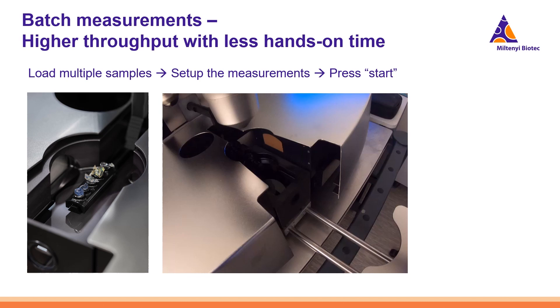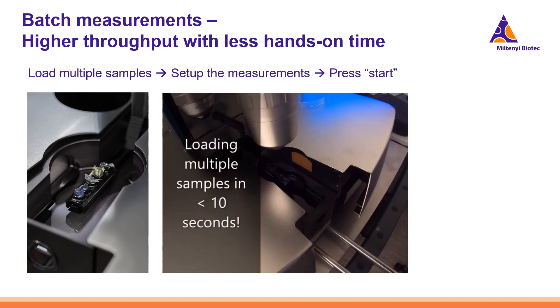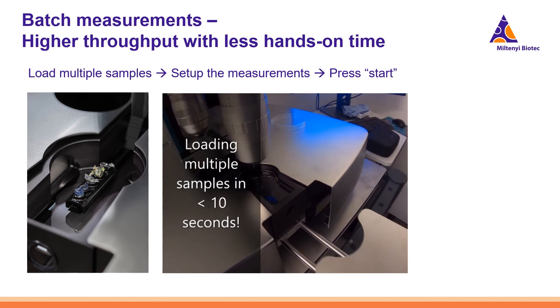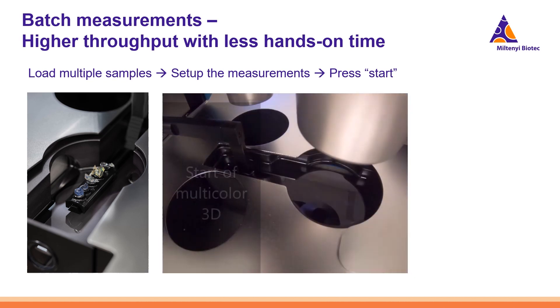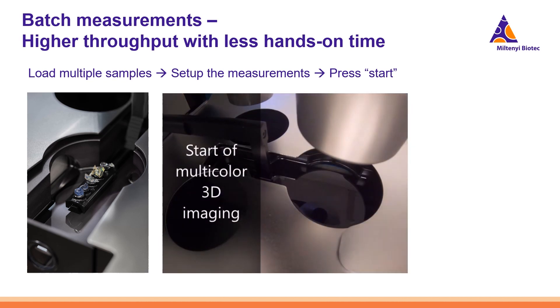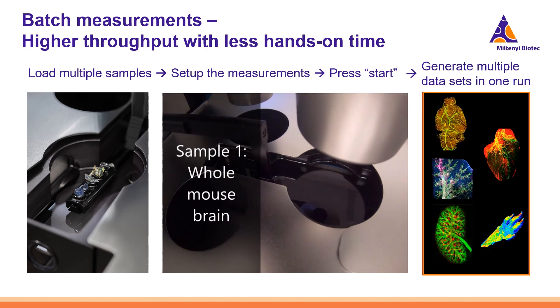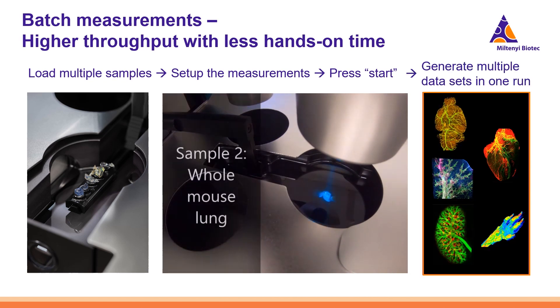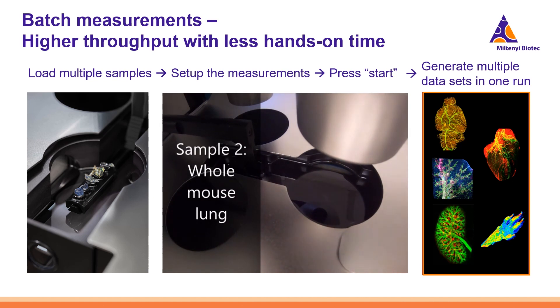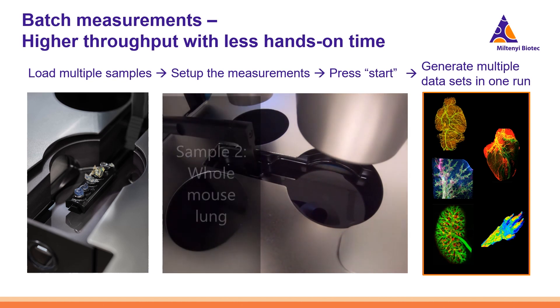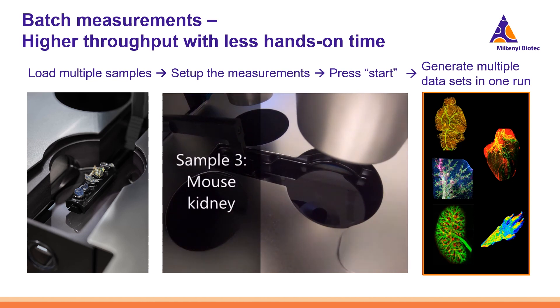The process of loading and imaging cleared samples is briefly demonstrated here, showing the seamless nature of the Ultra Microscope Blaze. Five different mouse organs are loaded in this example: mouse brain, lung, kidney, heart, and mouse paw. As I mentioned, you simply load multiple samples, set up the measurement, and press start — then you can generate multiple datasets in one run.